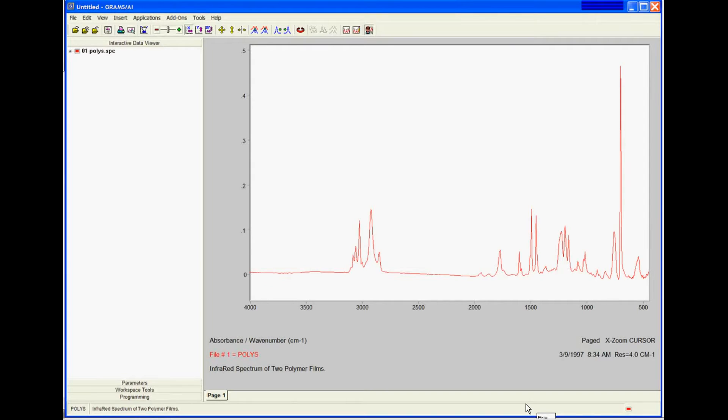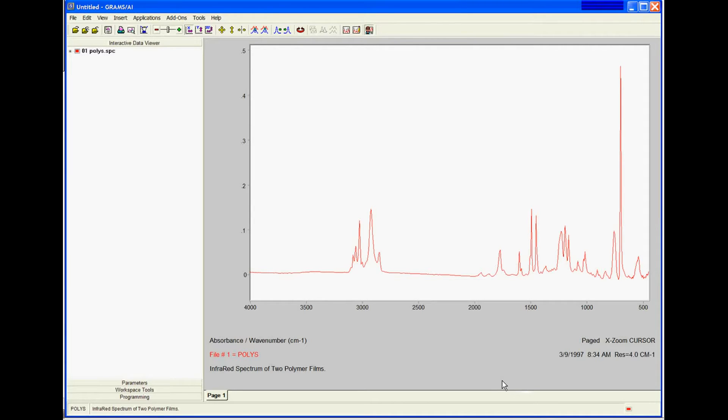Many times when users want to do a PowerPoint, they don't want to use the GRAMS default view. They want to do something that's a little prettier for their graphics. So we're going to quickly take this page and make it look better when we paste it back into our PowerPoint.